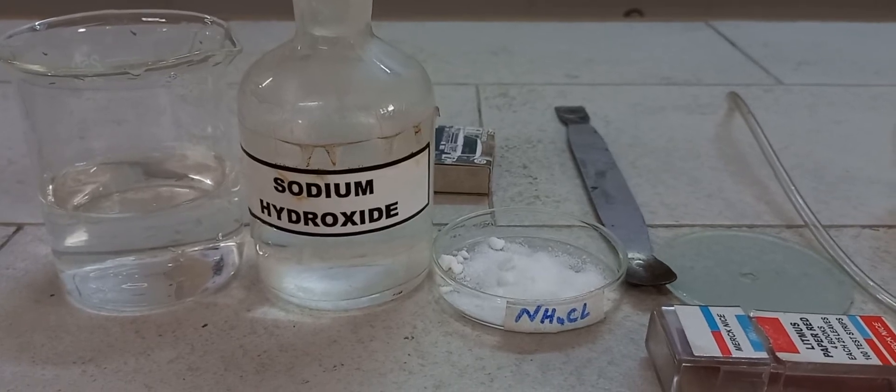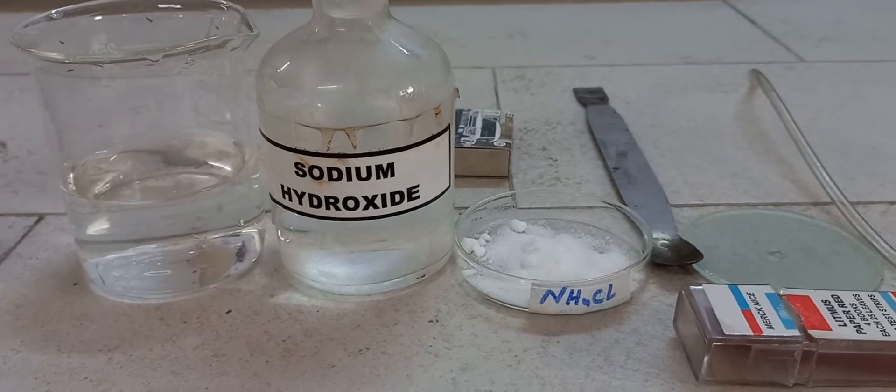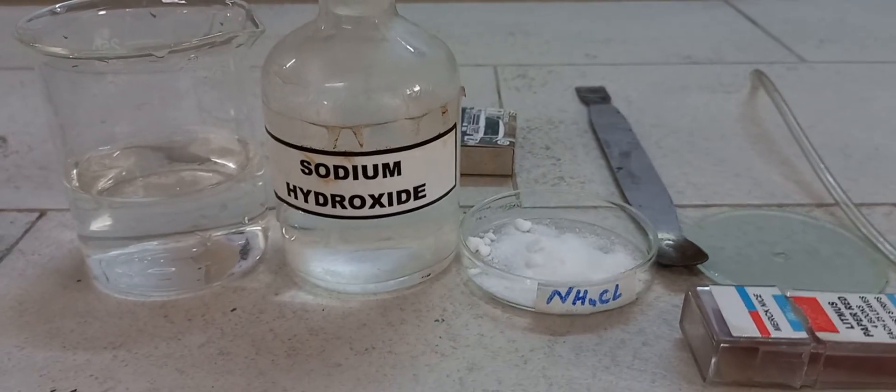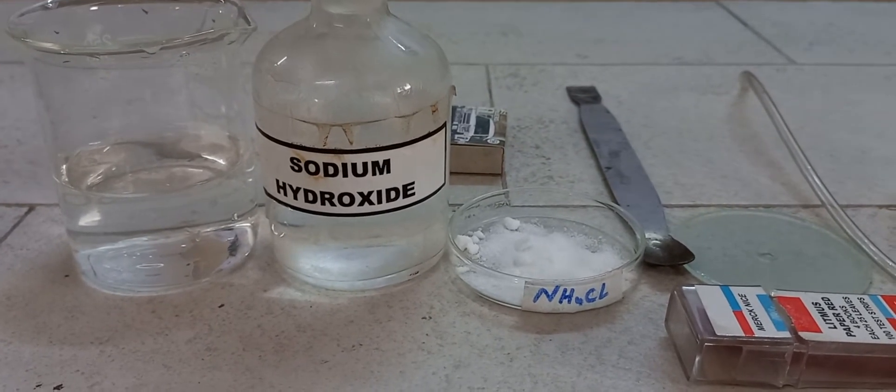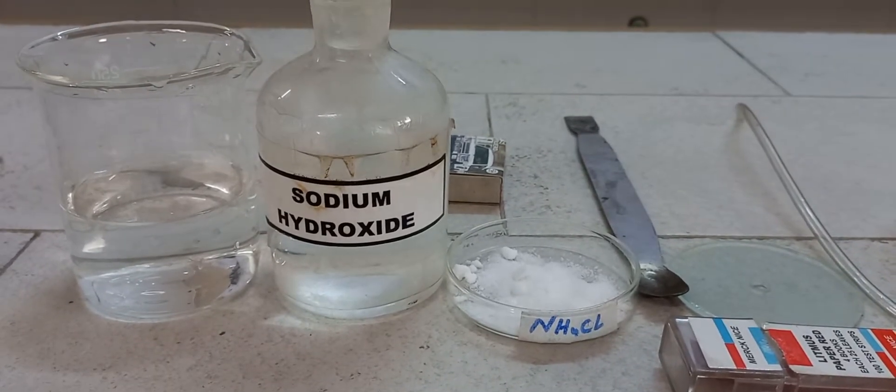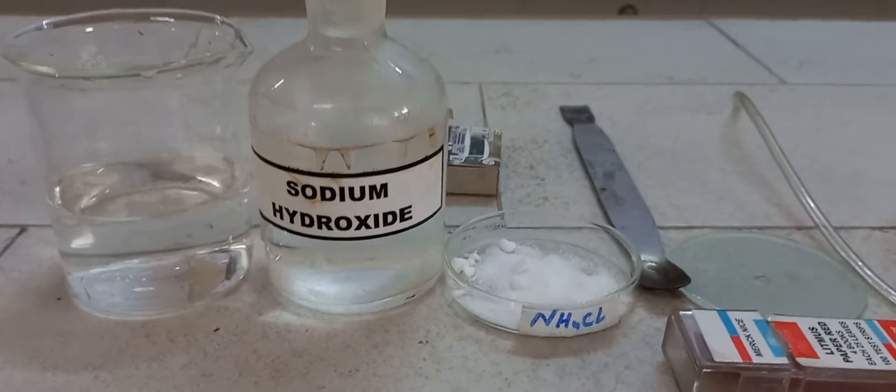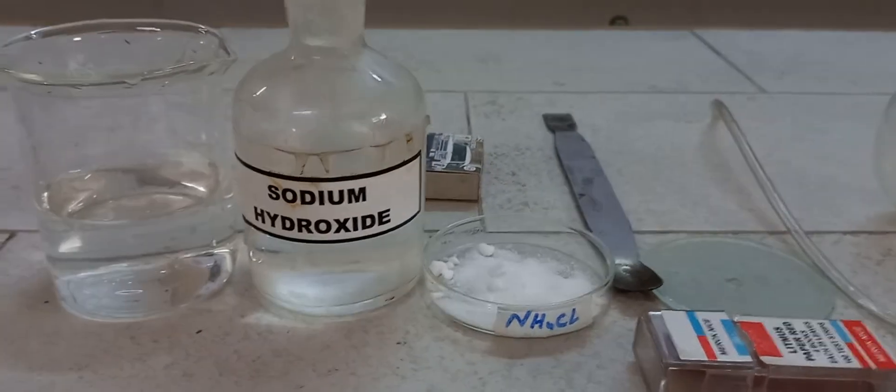In today's video we are going to see the preparation of ammonia gas. Ammonia gas is the only gas which is alkaline in nature. Alkaline gases or alkali turn the moist red litmus paper to blue. First we'll be doing the preparation of ammonia gas and then we will be identifying the ammonia gas.